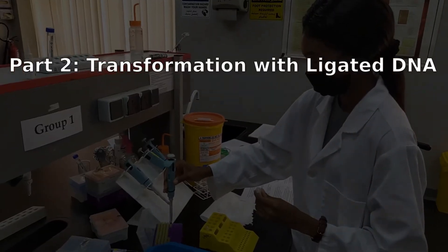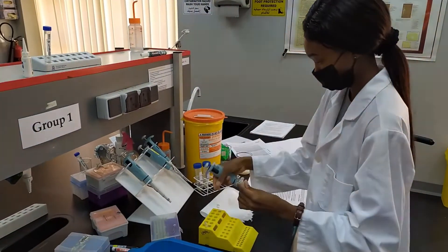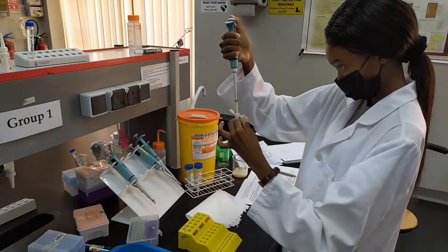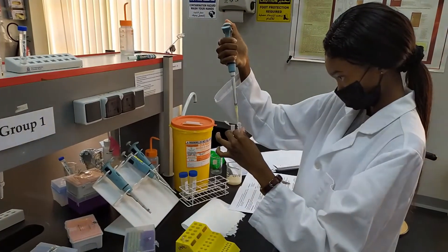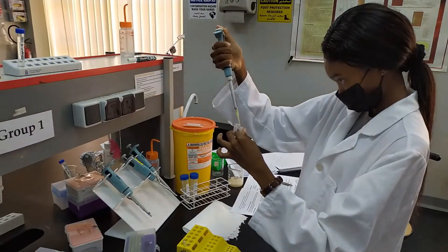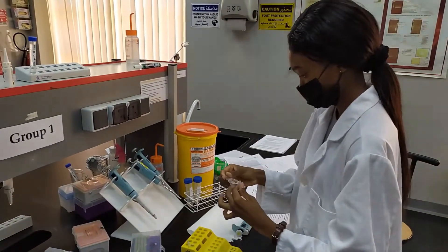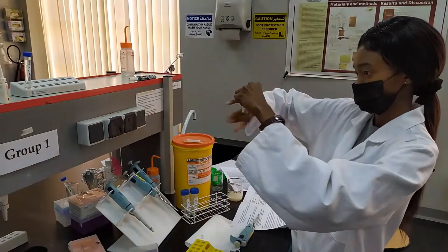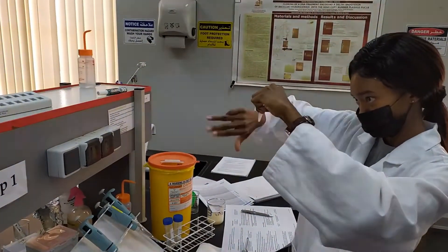After the incubation on ice, you will start with the actual transformation procedure. Two of your cultures will receive different ligation mixtures — use 20 microliters of the ligation mixture per tube, and make sure you keep track of which culture gets which DNA. The third tube will just get 20 microliters of water; this is going to be our negative control. After adding the ligation mixtures, just tap your tubes to mix them and distribute the DNA really well throughout your bacterial samples. Do not vortex.